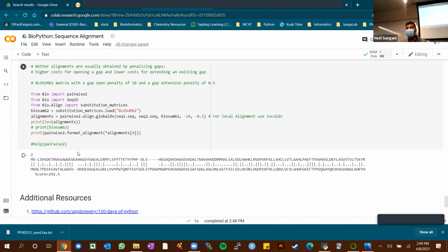There are more evolutionary trees and all the other things that you can do. There's BLAST in Biopython you can look into. It's a good package, and it's good that Pradeep, you suggested that we get into this. We did learn a little bit about Biopython in introductory Python classes, but never learned about alignments and how to get a lot of sequences into one file and do analysis.